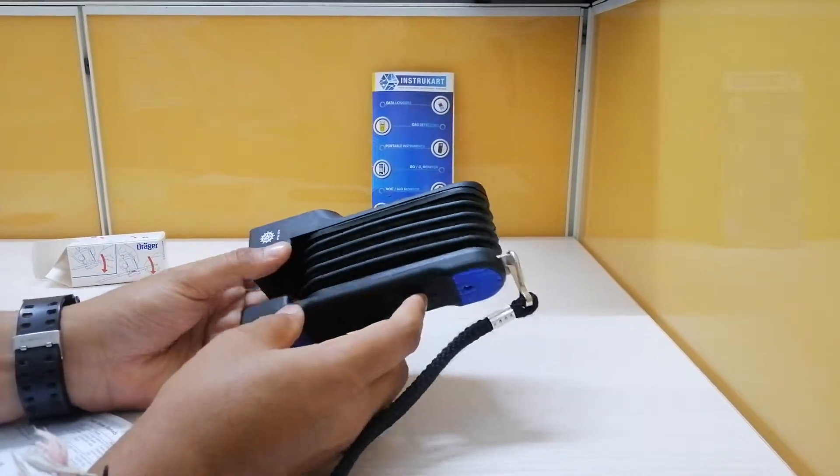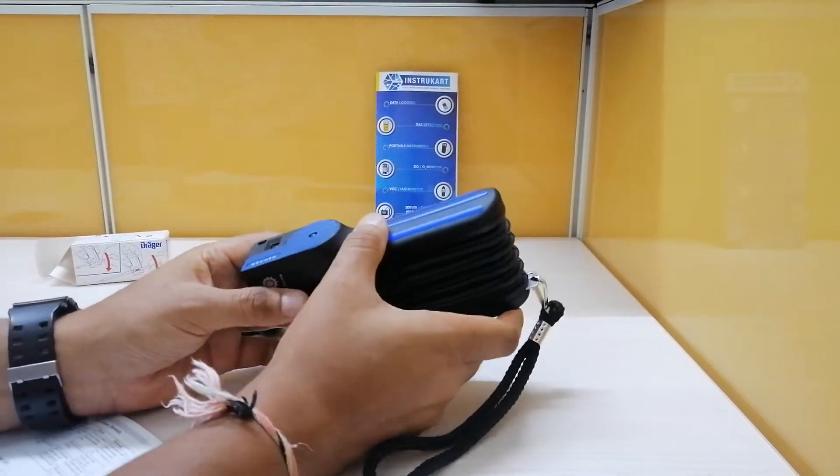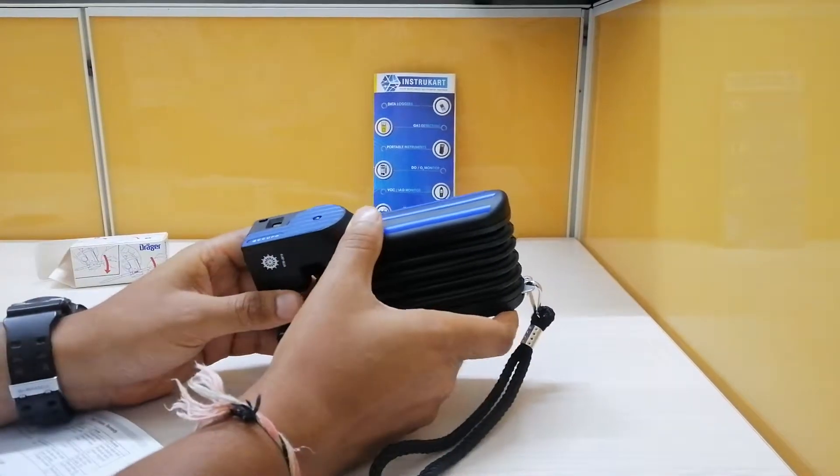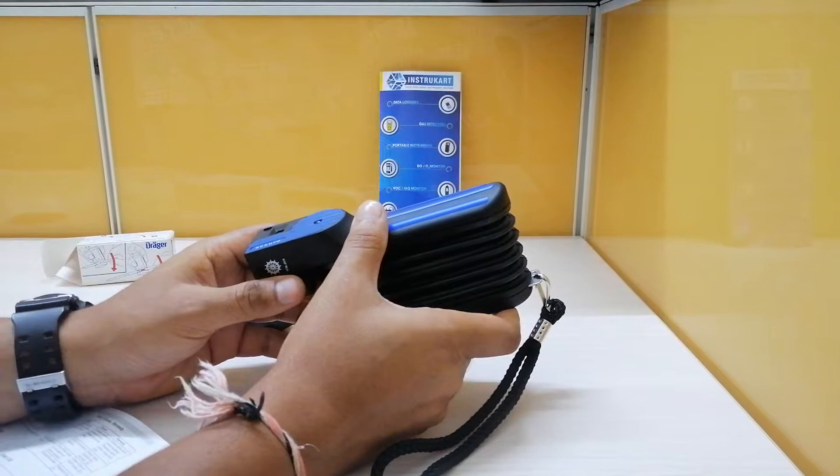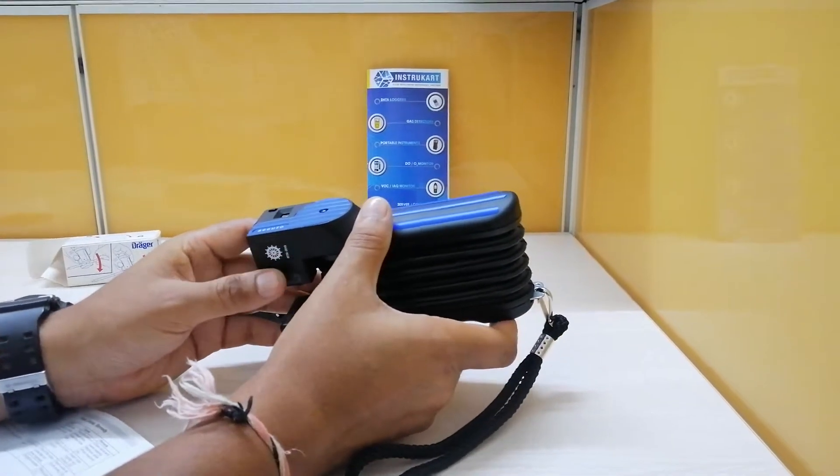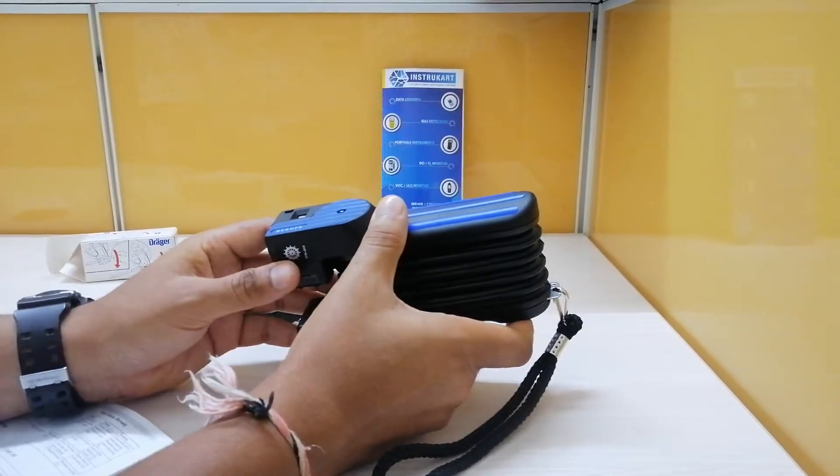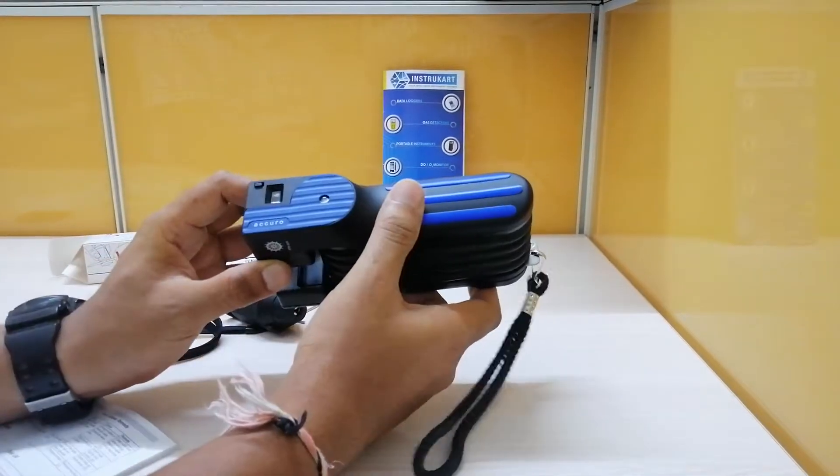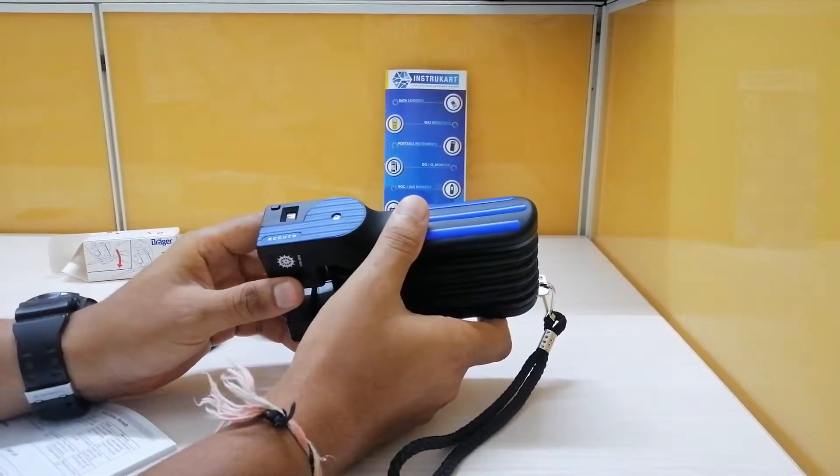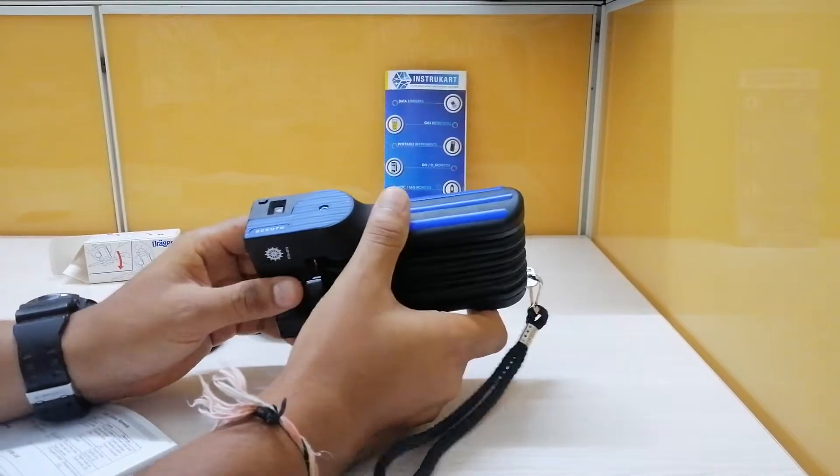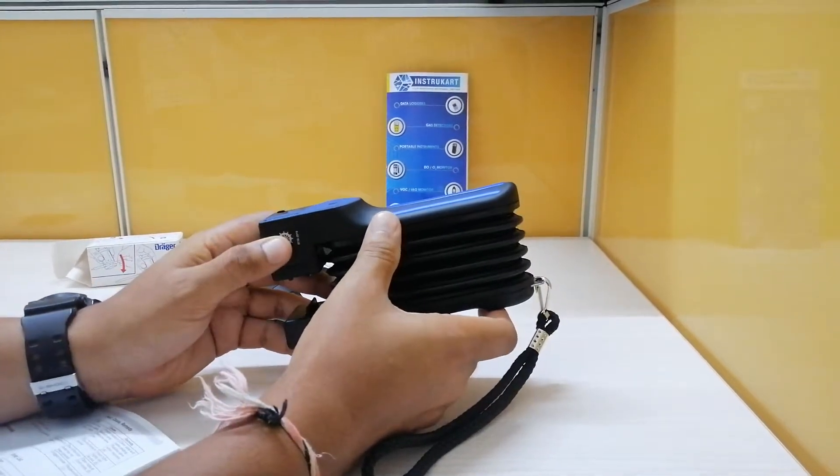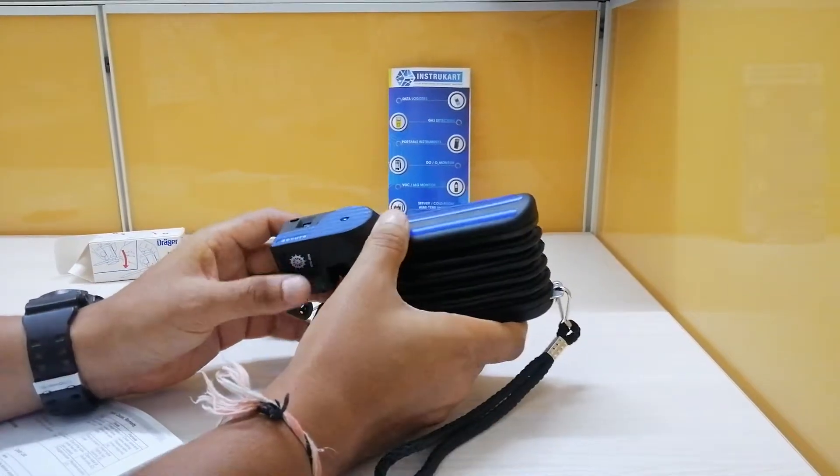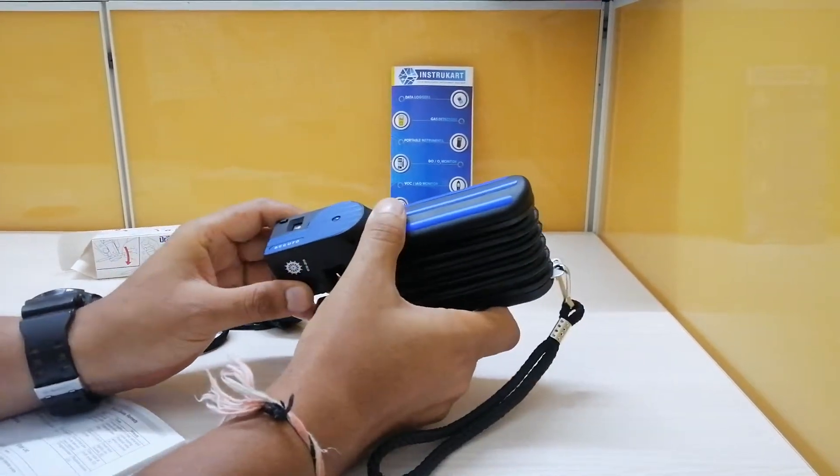This Draeger pump is used along with the tubes. The working principle is that a calibrated 100 ml sample of the air is drawn through the tube with the Draeger Accura series bellow pump. If the targeted chemical is present, the reagent in the tube changes color and the length of the color change indicates the measured concentration.